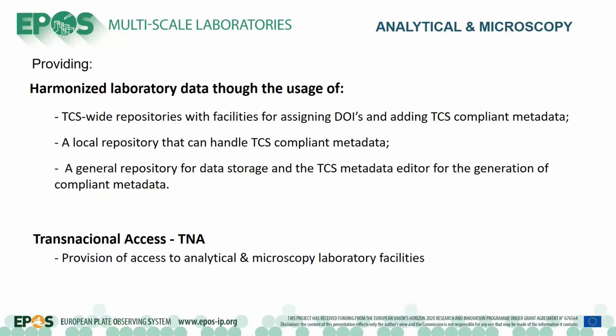This group provides harmonized laboratory data, contributing to the TCS repositories. It also has a local repository and a general repository for data storage, and the TCS metadata editor. The group also provides transnational access to the facilities, to the labs and equipment.